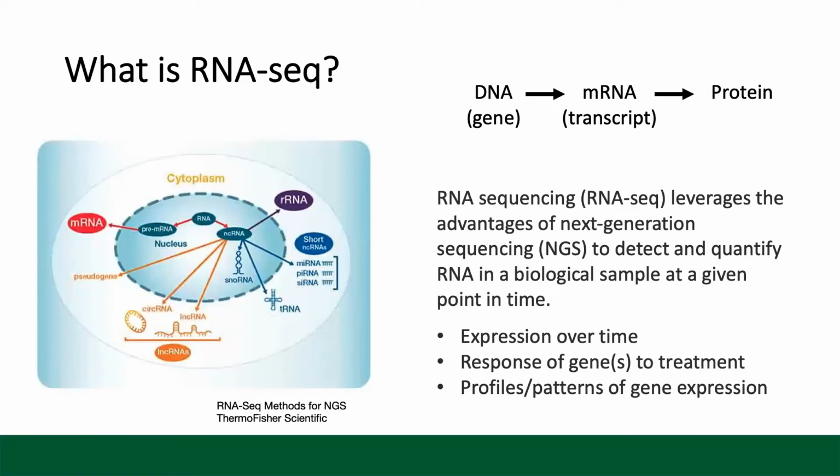Hopefully most of you have an idea of what RNA-Seq is, but if you need a refresher, it's basically what it sounds like. You're sequencing RNA molecules. Of course, there are many types of RNA molecules in cells, and today we are specifically talking about this little red section here, the mRNA. We're not going to be dealing with any of the small RNAs or long non-coding RNAs or any of that.